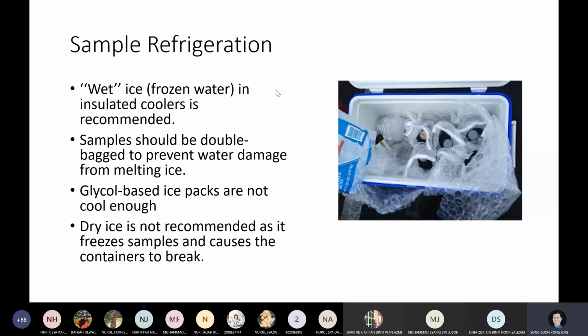And I think with this setup, the condition is nearing single digit degrees Celsius, if not 5, maybe around 7 or 8. That is good enough already, as long as they are not warm. So that's it. This is how you do your sampling, which is why, in reality, if you want to do water sampling, one ice box is not enough.